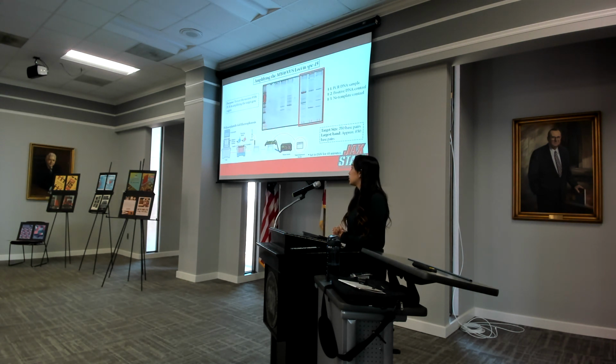And then a gel electrophoresis was carried out to assess the success of the PCR in amplifying the variant region. You can see an illustration of what that process looks like on the screen, but it was set to 150 volts for approximately 45 minutes to allow the DNA fragments ample time to travel through the gel. And in the middle, you can see the scan of the results of the gel.